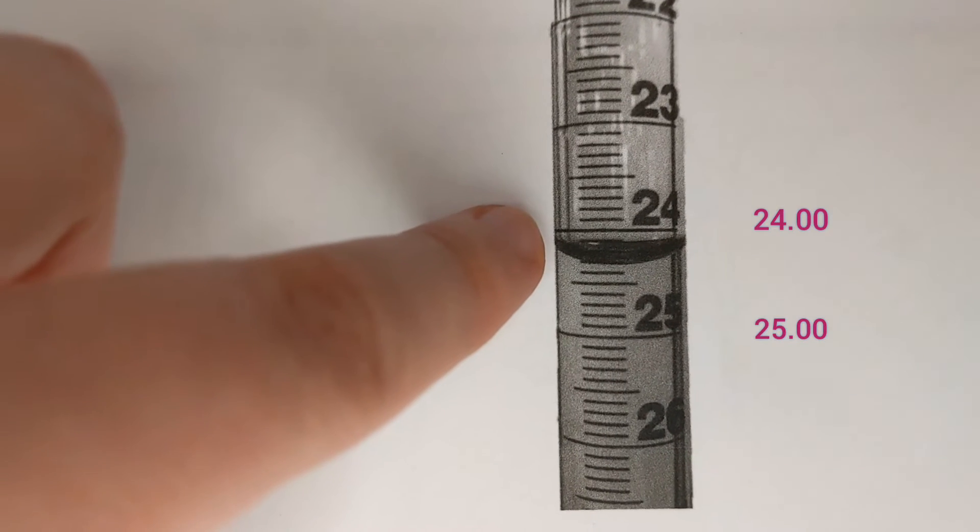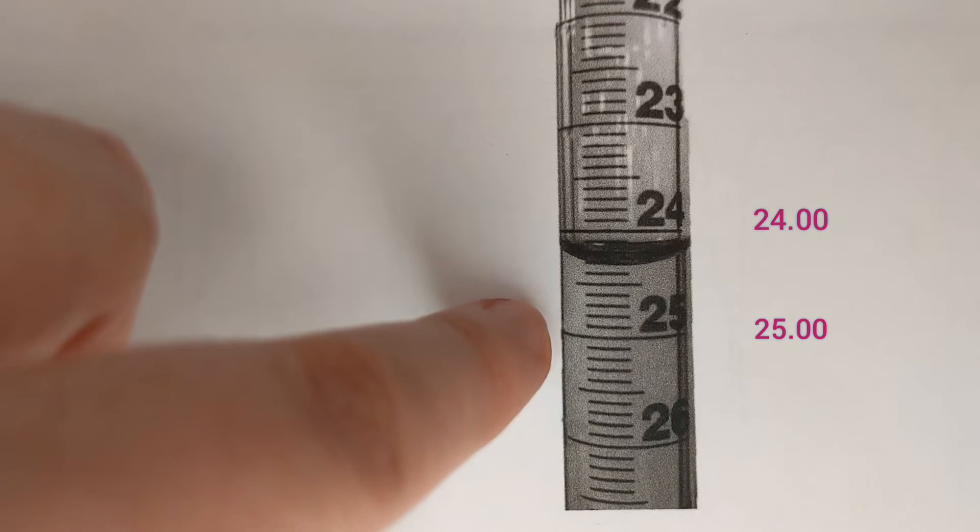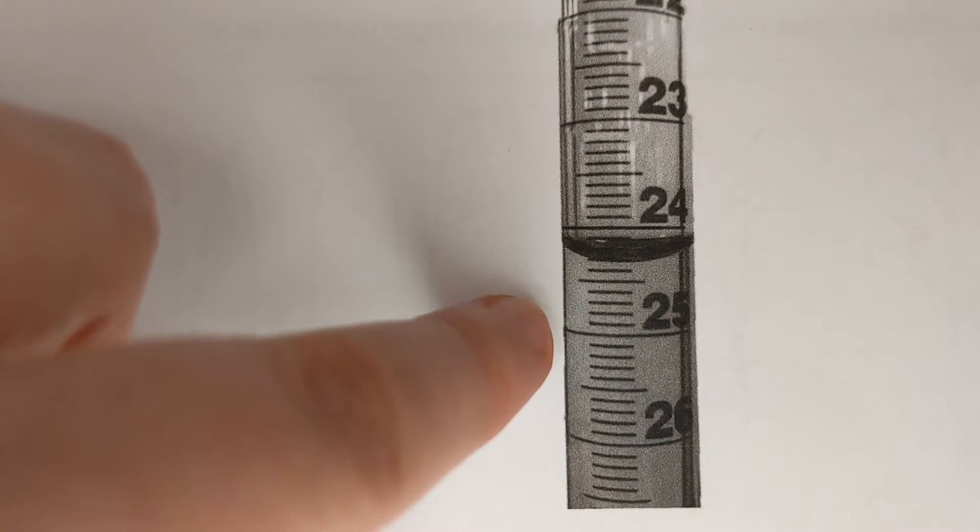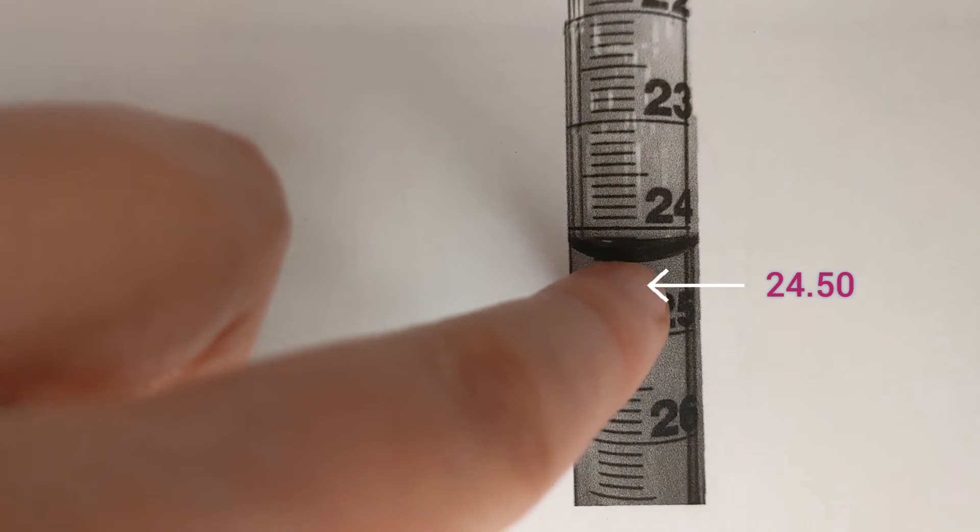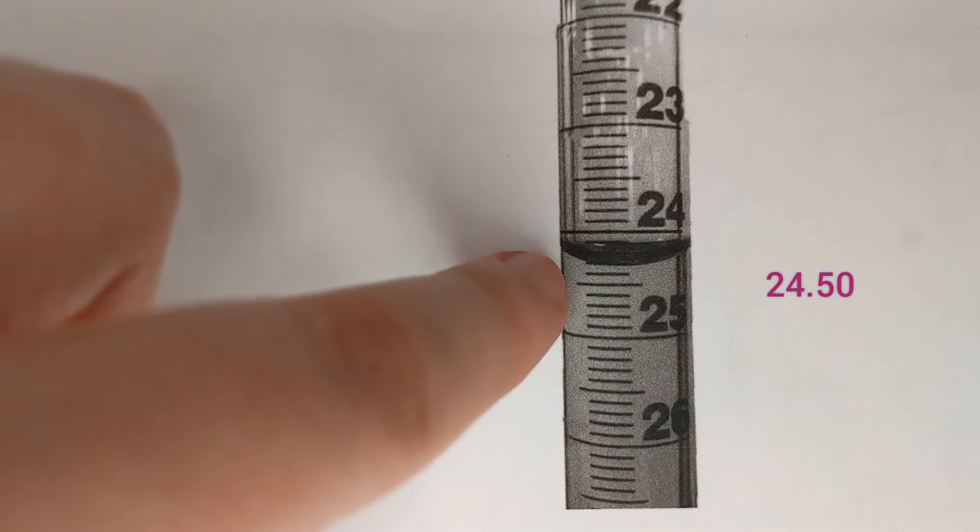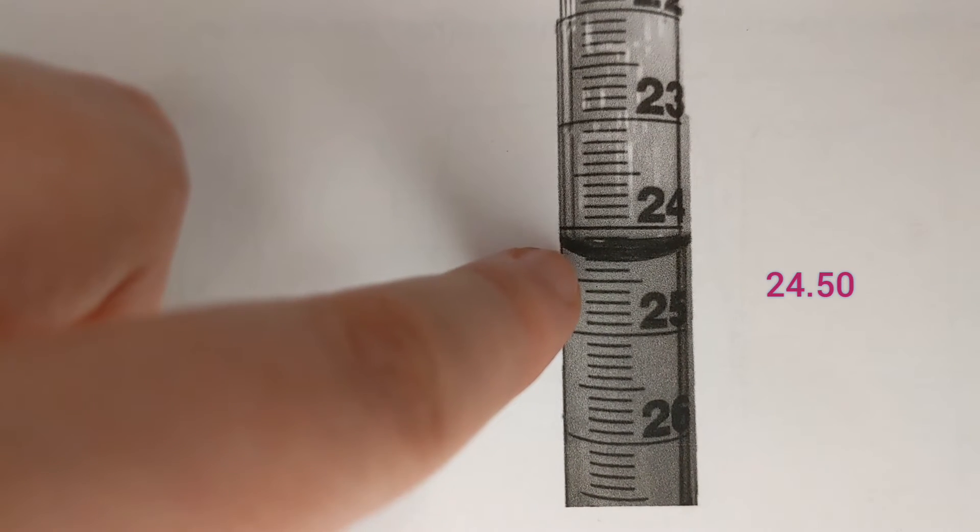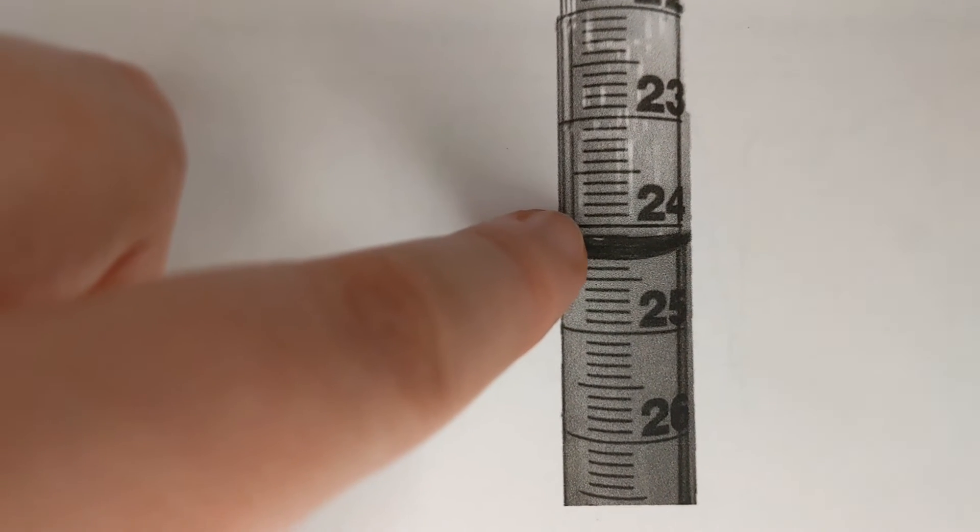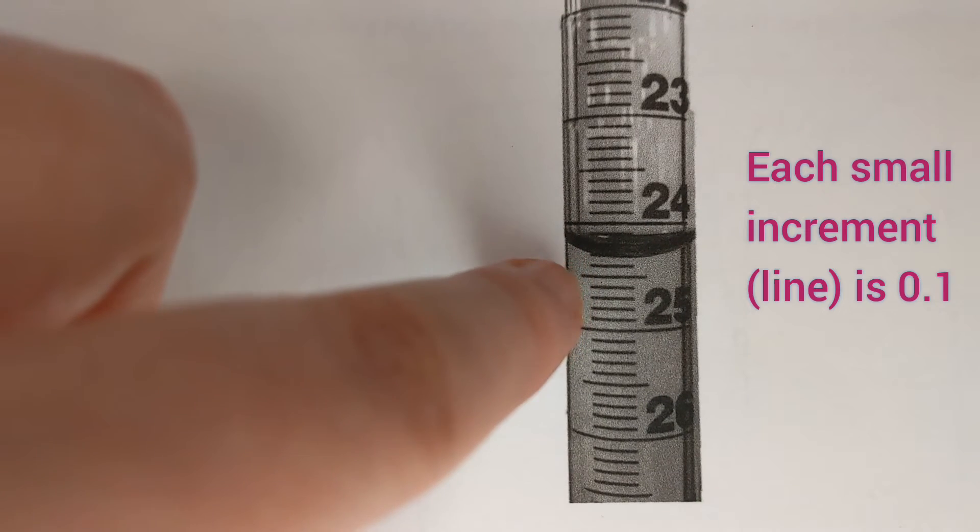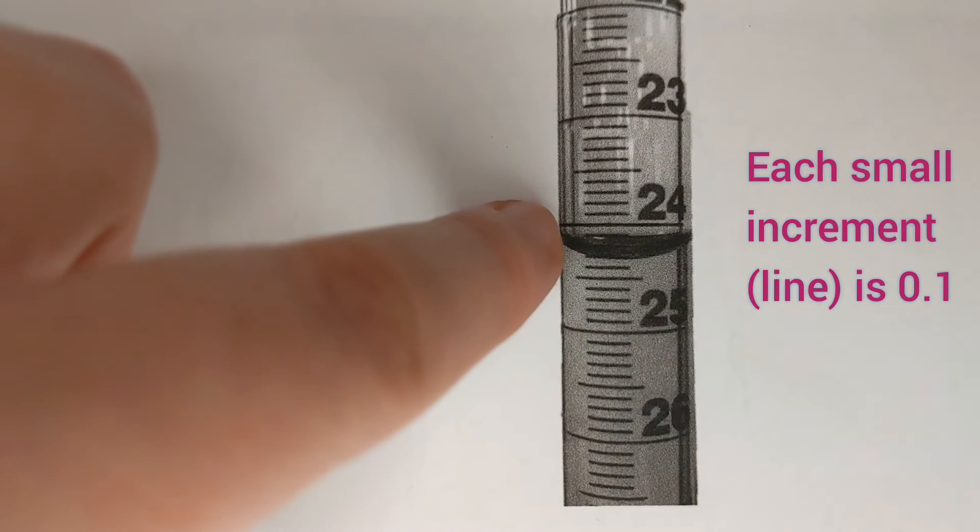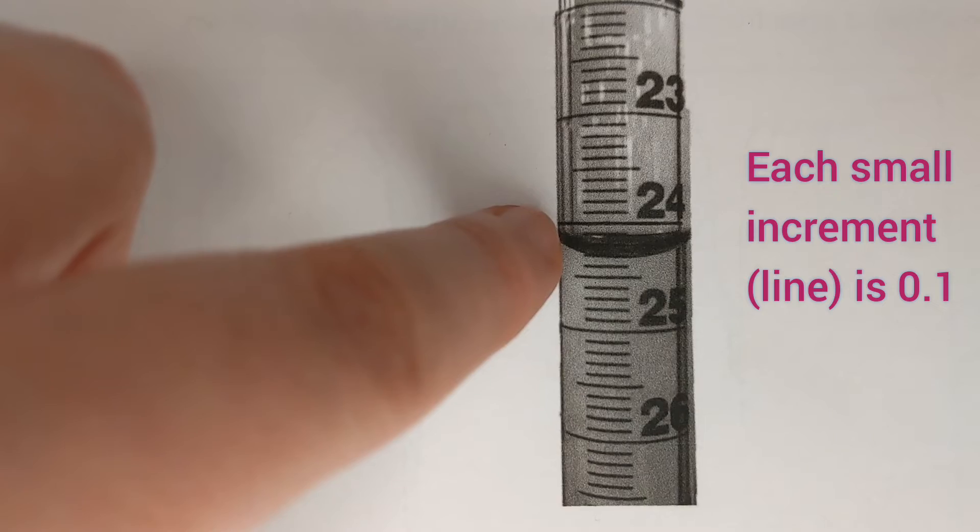So this long line here is the 24mm mark, this long line here is the 25mm mark and this longer one in the middle is 24.5. So that means these little graduations in between must be 0.1 mils each.